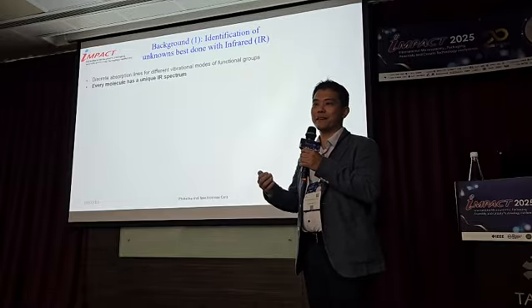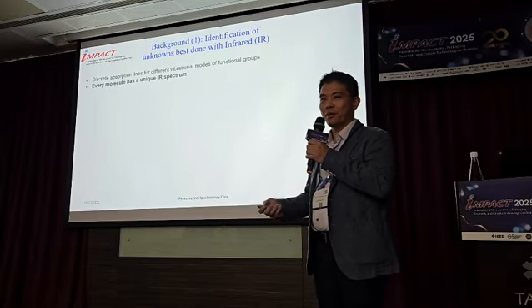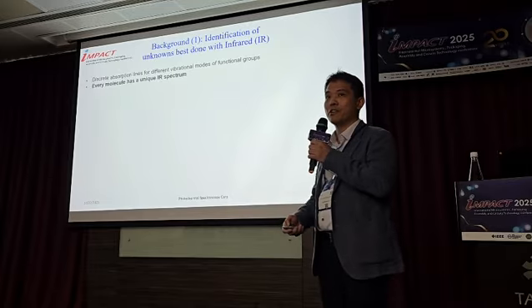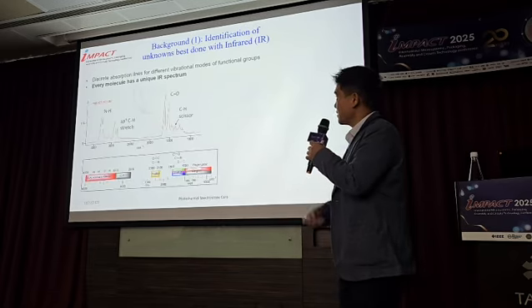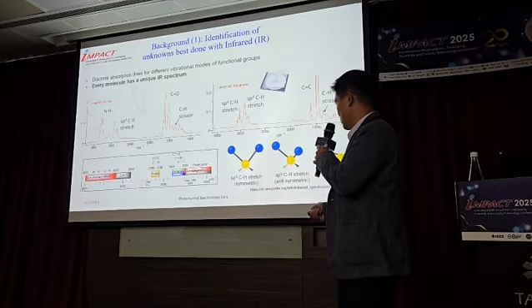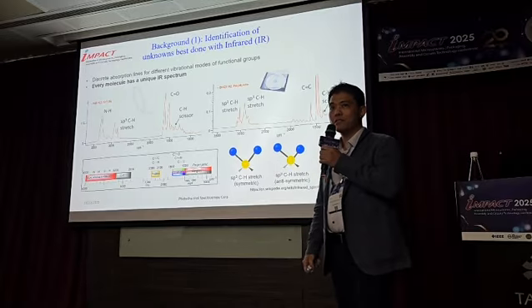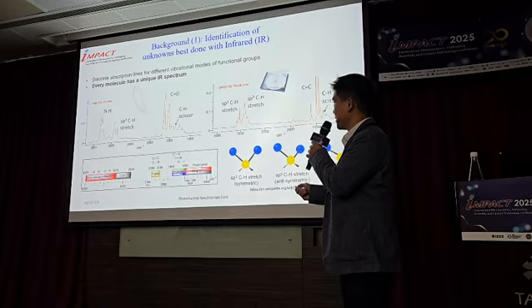Back in the college days, we learned how to interpret these spectra, because based on these functional groups, we can figure out what the molecule is, and every molecule should have its own unique IR fingerprint. That's why we can separate the difference between nylon versus polystyrene, as a general example. Each of these functional groups has different vibrational movement, so based on these bands, we can tell what they are, right?